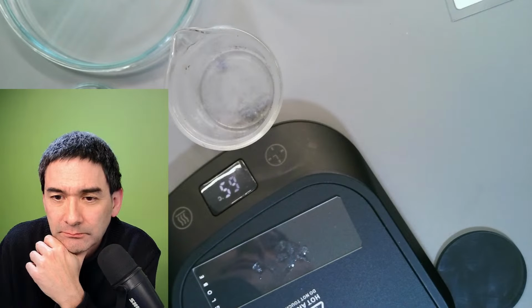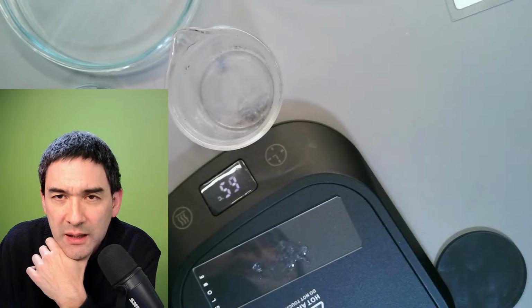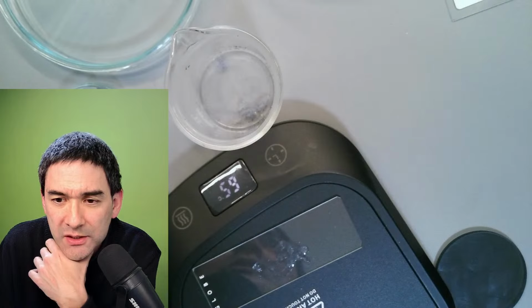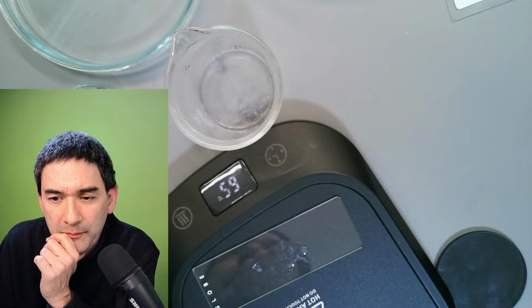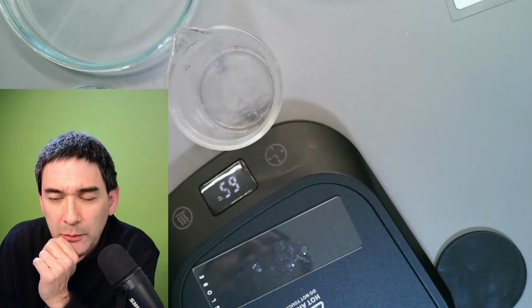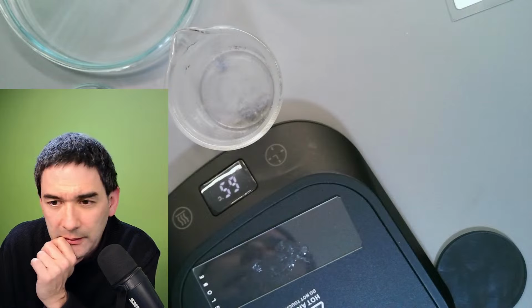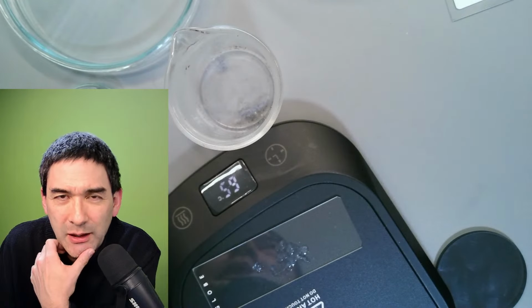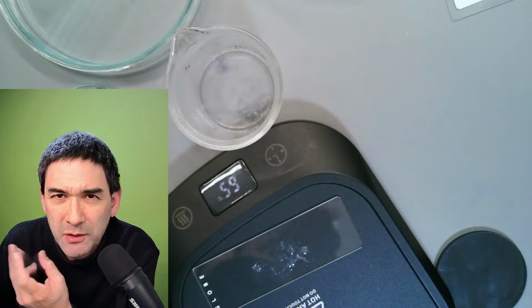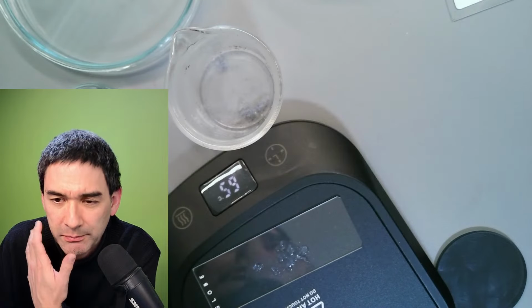Asbestos. Yeah, asbestos fibers, honestly, I've seen and read somewhere that there are different types of asbestos fibers. However, I'll be honest with you, you probably don't even have to observe this under the microscope. You should be able to tell just by looking at it. What I advise against is trying to cut things apart as asbestos, because you shouldn't be inhaling this stuff, as we know by now.